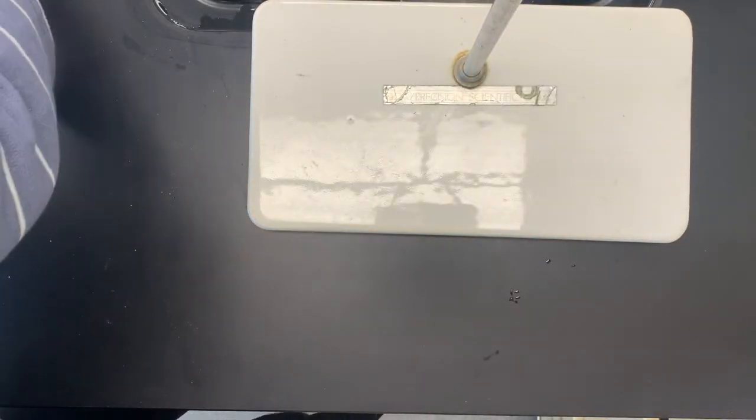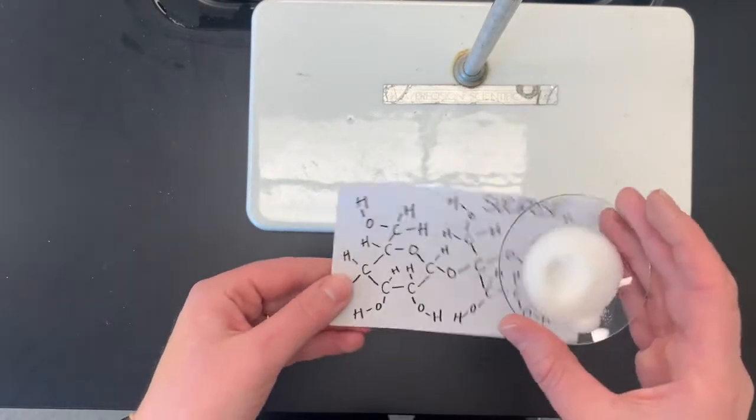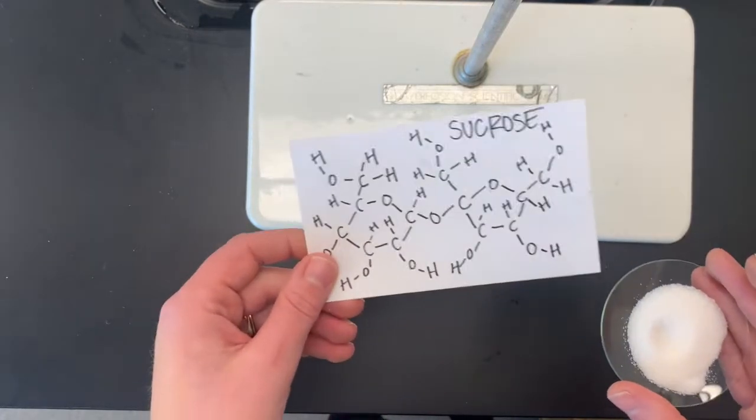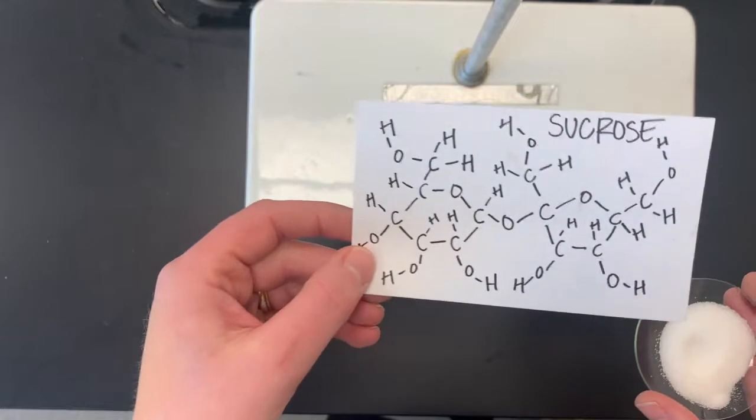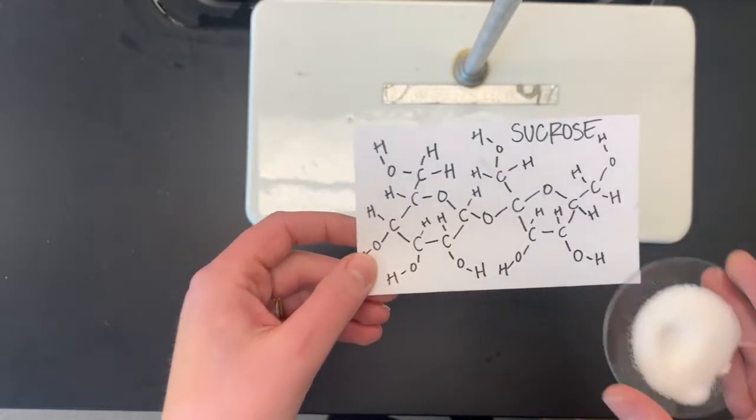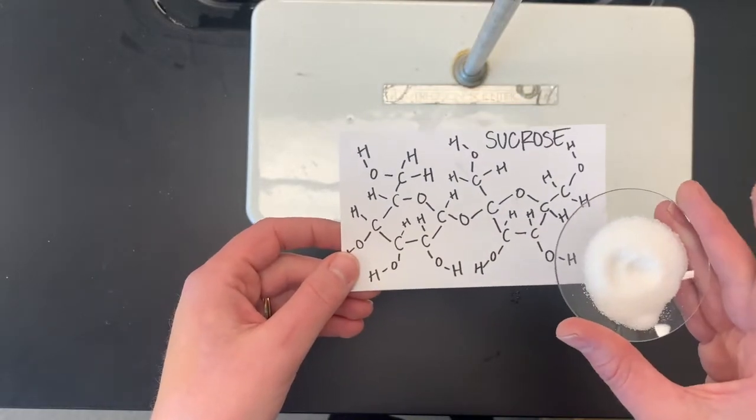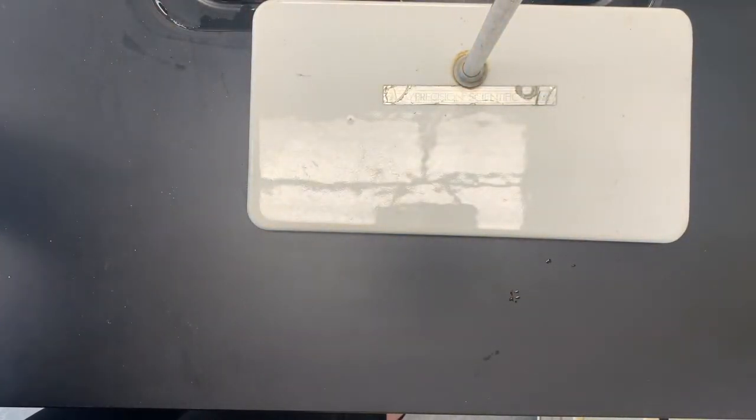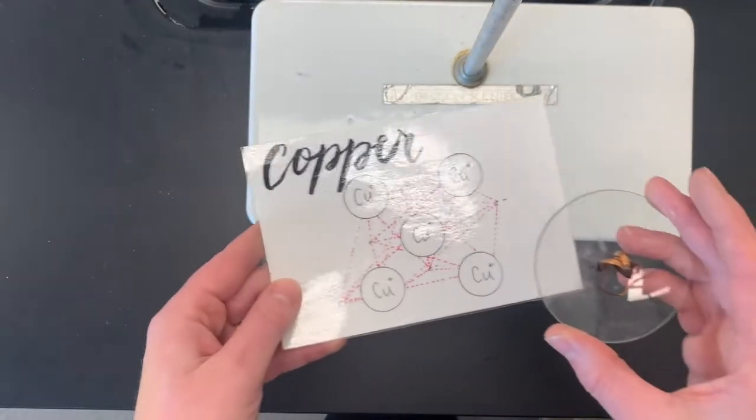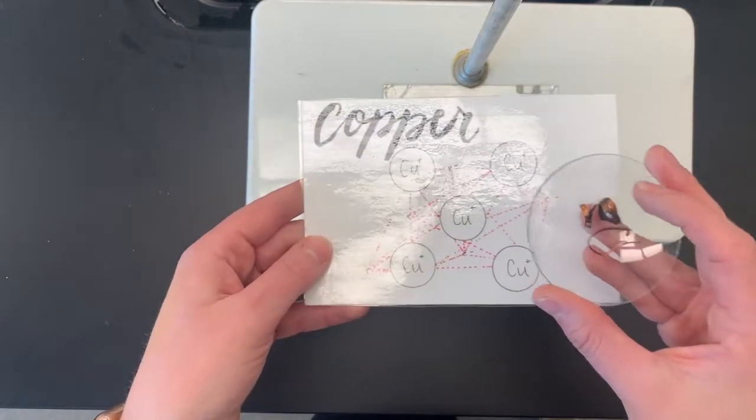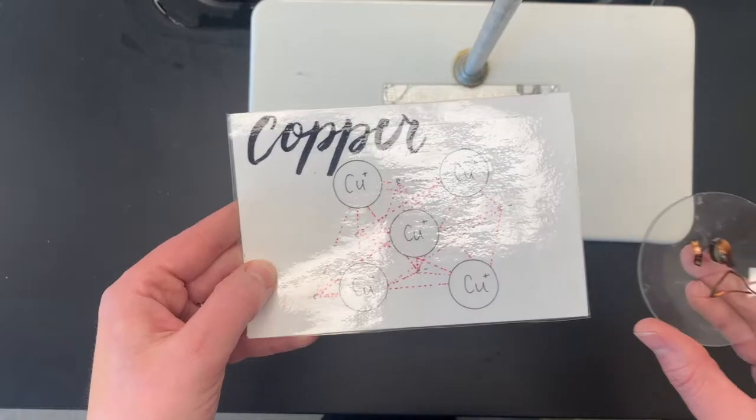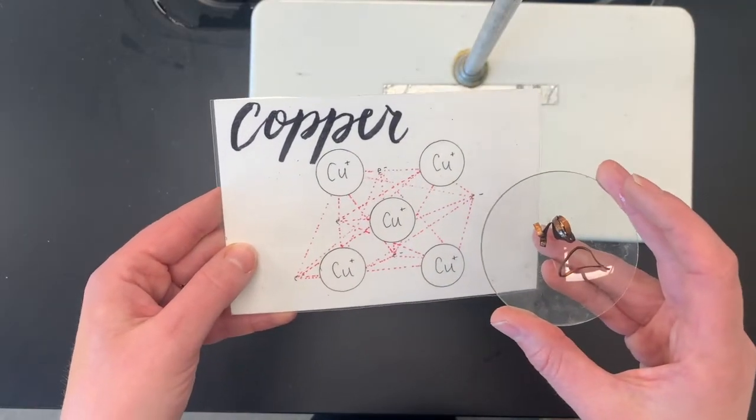Next we have sucrose, aka this is table sugar. So this is what you might mix into some nice lemonade. There is one molecule of sucrose right there. And there it is in the watch glass. Next up we have copper. So I have some copper in the watch glass, some copper wire here, and then that is its bonding modeled.